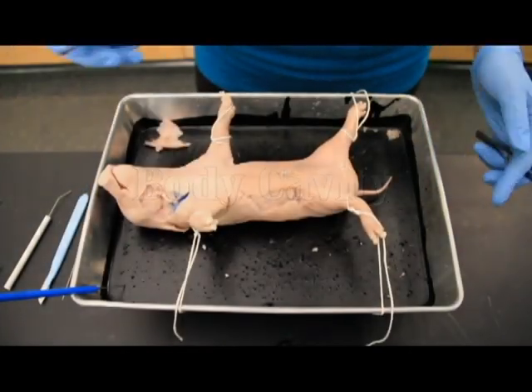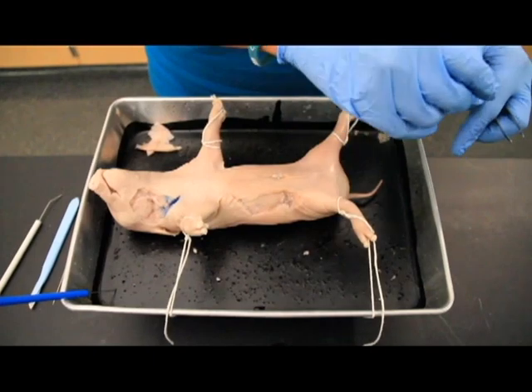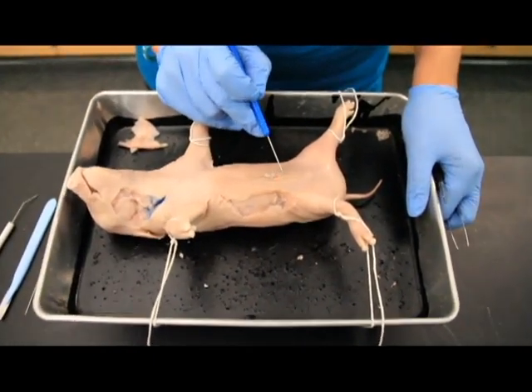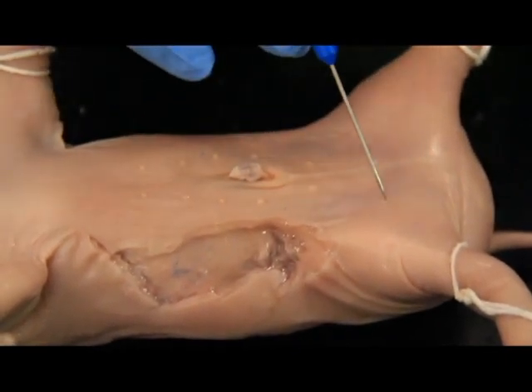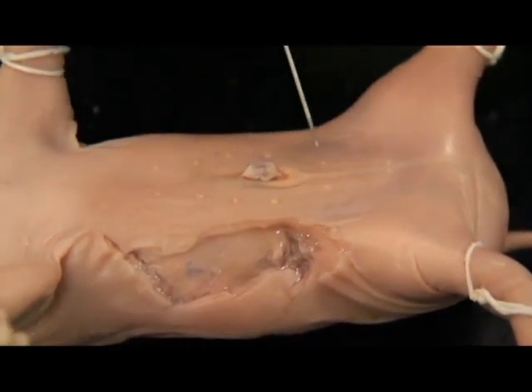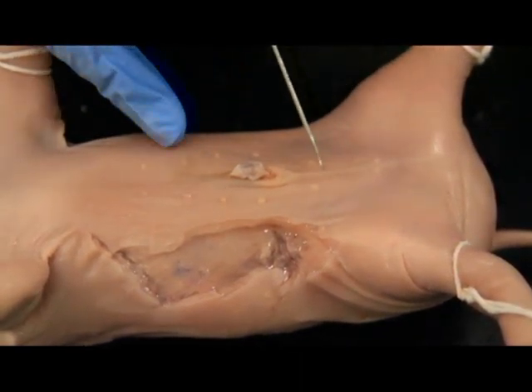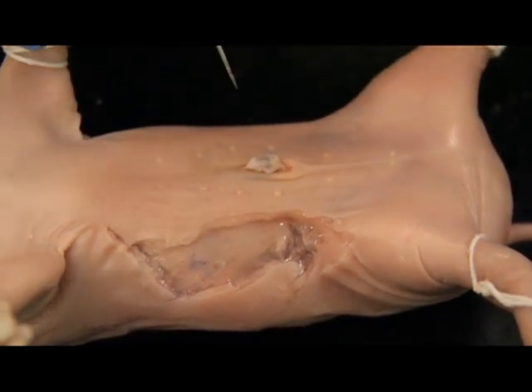Okay, so now we're going to move on to the body cavity, and what's really important is the way you cut into the pig. If you have a female, you're going to cut around the umbilical cord, but cut all this away. If you have a male, you're going to come up here above his urogenital opening and down and leave this flap intact because that's where his reproductive system is. So again, follow your manual closely and it'll tell you how to get in here.